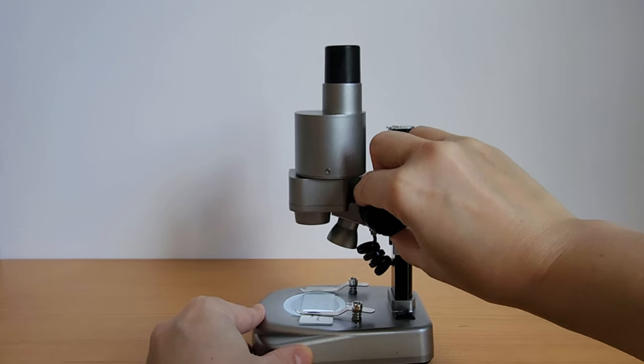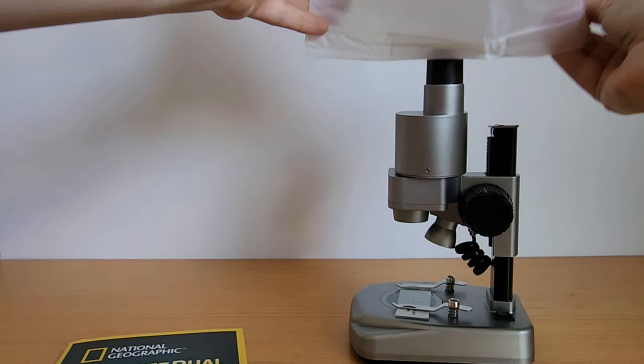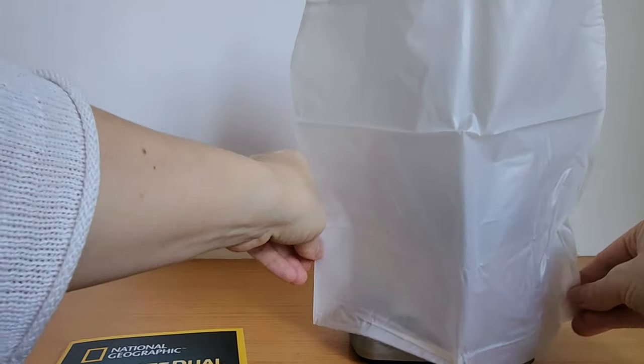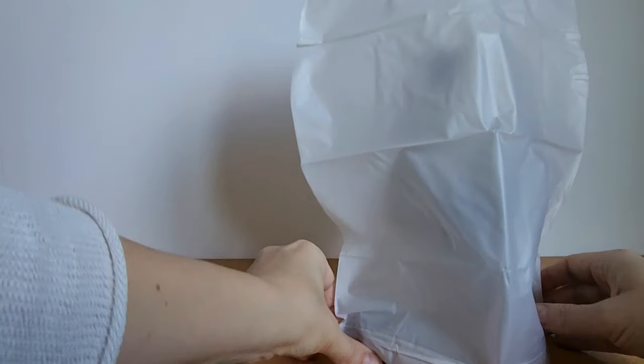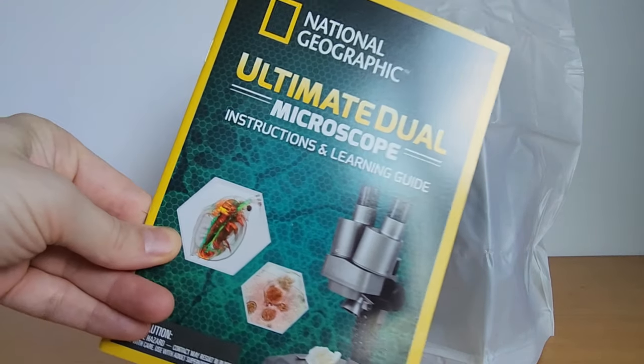It's very sturdy, so the kids can just go and use it on their own. It comes with a dust cover so you can set it up very easily and have it out on a desk for the kids to be able to use whenever they want.